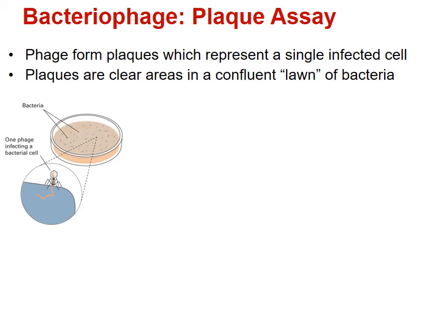So how do we look at bacteriophage? For bacteria, most of you are now used to spreading bacteria onto a plate. You put some bacteria, a culture that has bacteria on it. You either spot plate it or you spread plate it, and you spread the bacteria around, and you'll see colonies appear after some time. Well, bacteriophage can't do that. If you put bacteriophage on a plate, they're not going to grow because they need a bacterial host. And so we have to do something different.